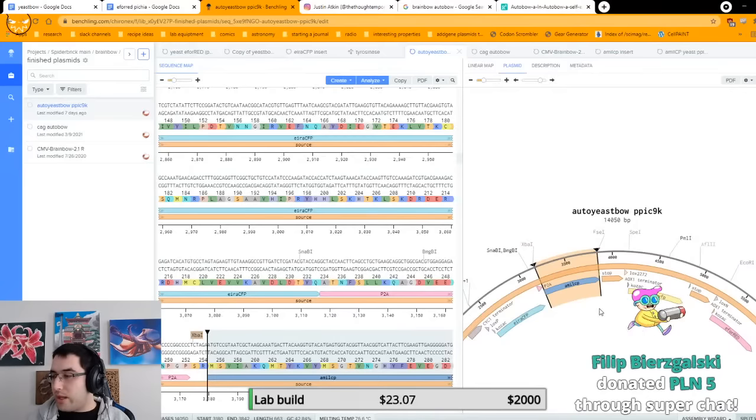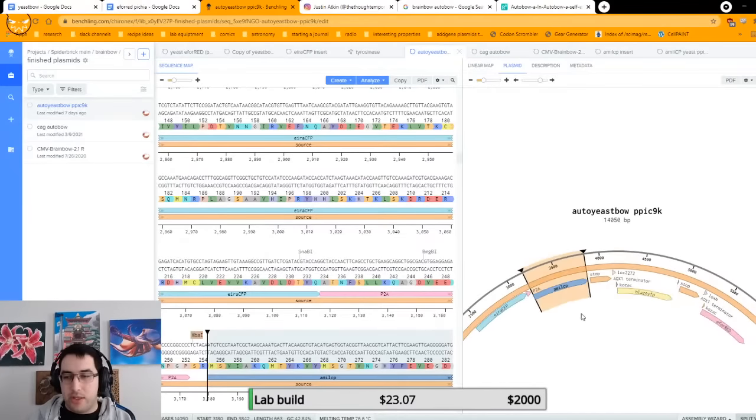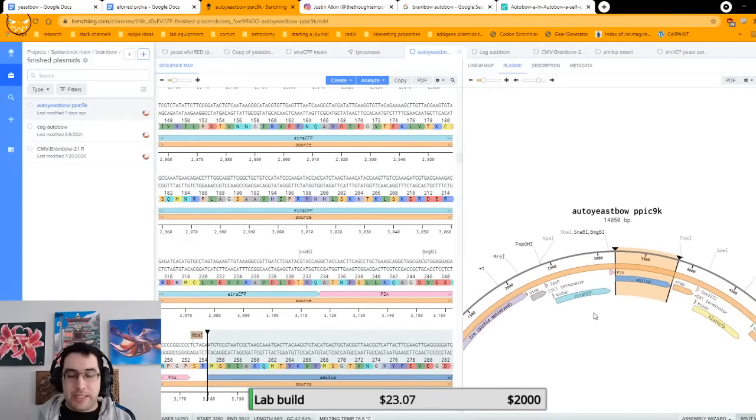So basically, the way this works is this little P2A right in the middle is essentially like a little genetic hack where you get two things for the price of one, right? So when this does its randomization, you know, spin the wheel, pick a color thing, if it lands on blue, instead of making one protein, it'll make two. One that glows blue and one that is blue. So this way, if you don't have any access to a UV light and a filter or whatever else, you can just look at the thing and it'll be blue.